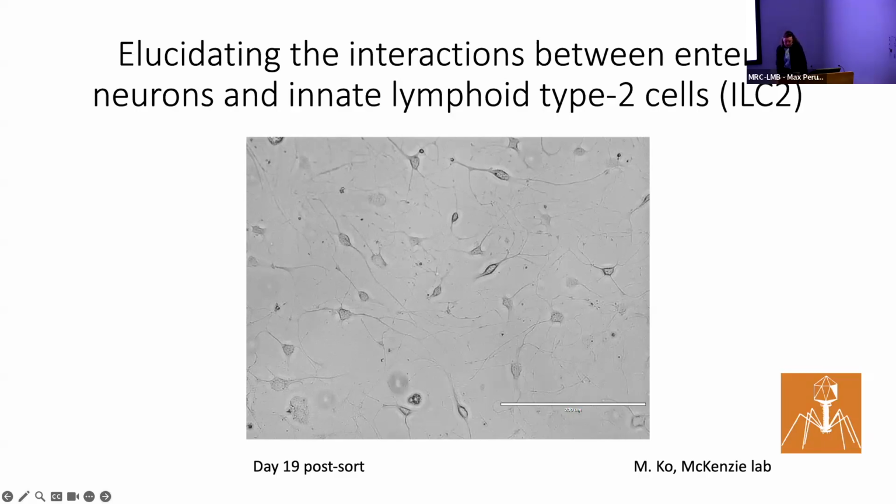And it is very difficult to study this population of neurons in a heterogeneous mix of neurons and glia, and this is where cell sorting comes in. So we purify these neurons of interest using a transgenic mouse strain where these neurons express tdRFP, and then she cultures them downstream to perform transcriptomics and for in vitro assays.